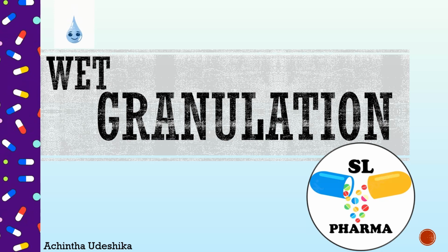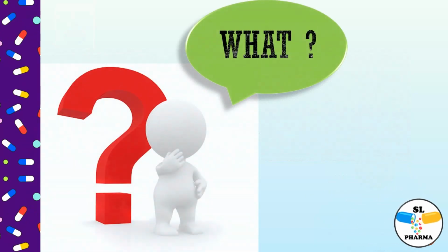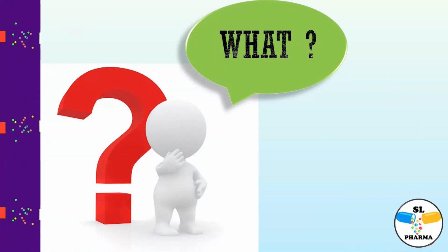Today we are going to discuss wet granulation. First we will see what granulation is.